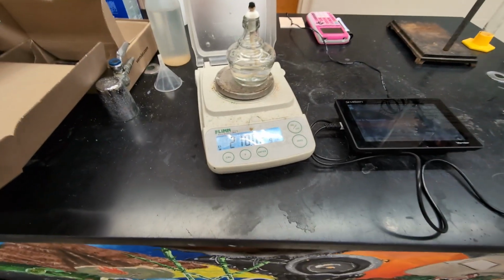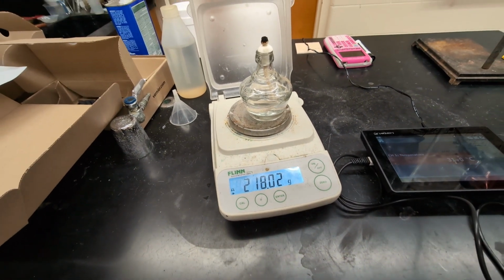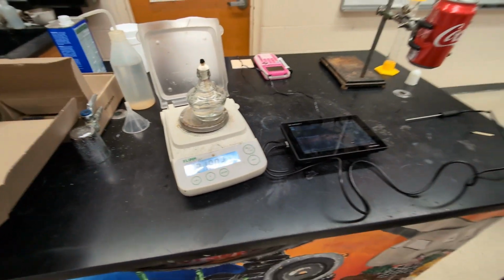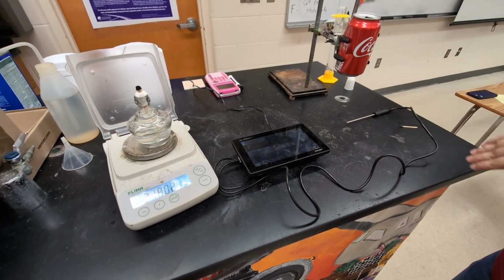Okay, so the temperature of the water changed by 10 degrees Celsius, and then I put the burner back on the balance, and so you can see the mass is now 218.02 grams. So some of that ethanol burned and changed into carbon dioxide and water vapor.